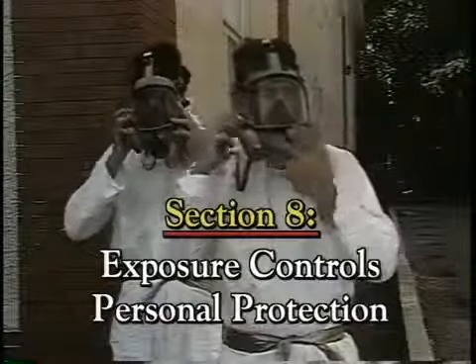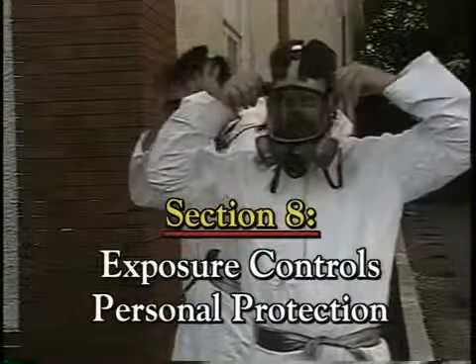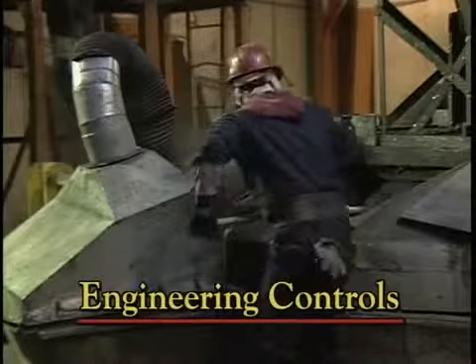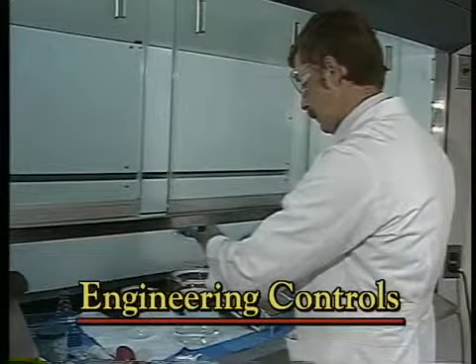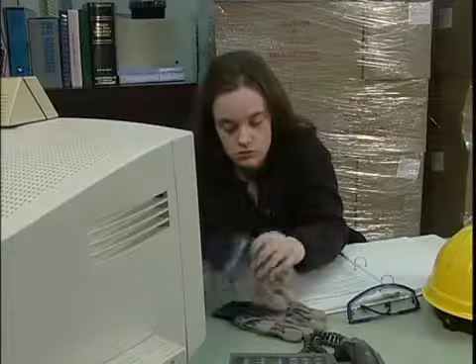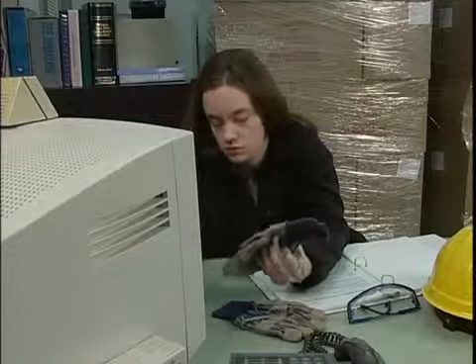Section 8 of the ANSI MSDS addresses exposure controls and personal protection. This section describes any engineering controls, such as local exhaust ventilation systems and laboratory hoods, that are required to work with the material safely. The personal protective equipment you should wear, such as safety glasses, face shields, or rubber gloves, will be listed as well.